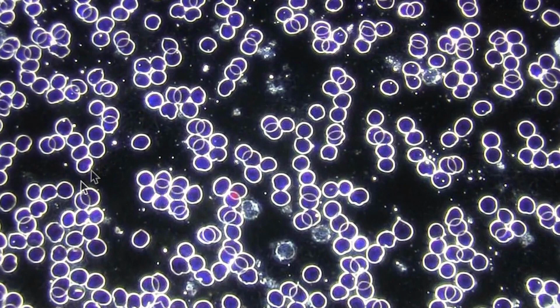After that last sample of blood we looked at, the person did a 1-hour treatment with a frequency device called a Healy, which sends microcurrent specific frequencies into the person's body, and that was 60 minutes. It was on a program called Immune System. Immediately after that treatment, I looked at her blood, and this is what we saw.